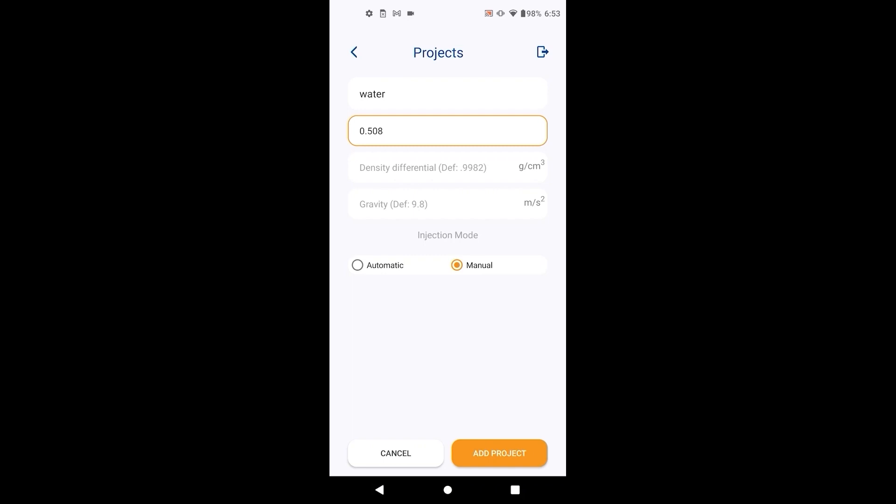We recommend that you measure the diameter of the needle with a micrometer before starting the experiment to ensure proper calibration. If you are using the polynomial method you do not need this value.